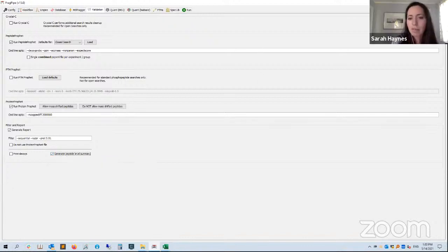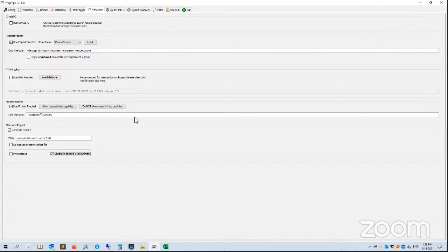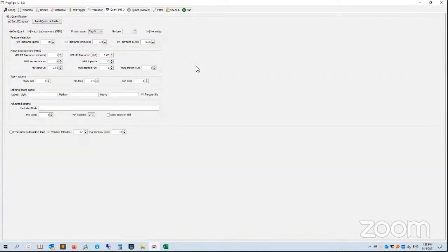And one more question: is the MBR peptide FDR of 1% common, or is that a little bit high? Yeah, let me answer that. What to specify is the MBR FDR, right? So we recommend 1%. And if you read the paper, we have an extended discussion on that. Because in typical data sets, like HeLa, any cell line, tissues, we do not see a need to go beyond 1% because we just start adding noise. We're not transferring a lot more ions, but we start getting a lot more false transfers.